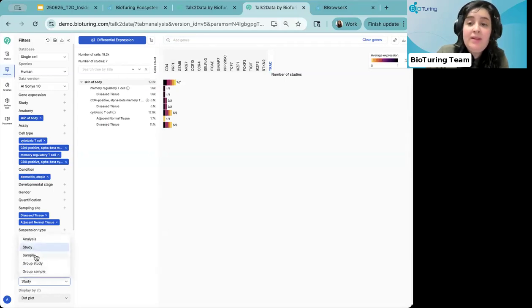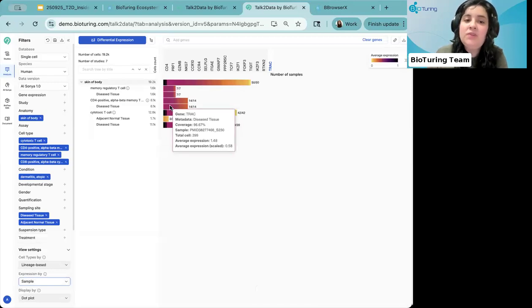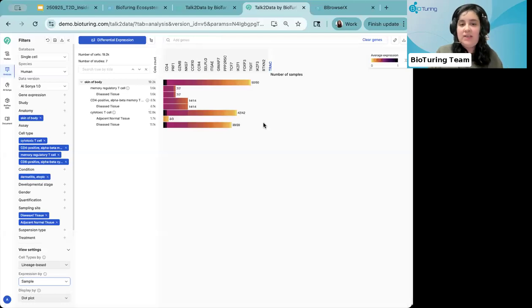You can also look at sample variability across multiple studies within the public database. Especially when looking at these different cell types within these different lesion sites, you want to see if this is consistent across multiple samples or only coming from very specific samples. You might then want to look further into that data set and understand the clinical context, or what parameters were used in those data sets specifically. So this is how you get from one study to a multiple-study context and large-scale analysis viewpoint.